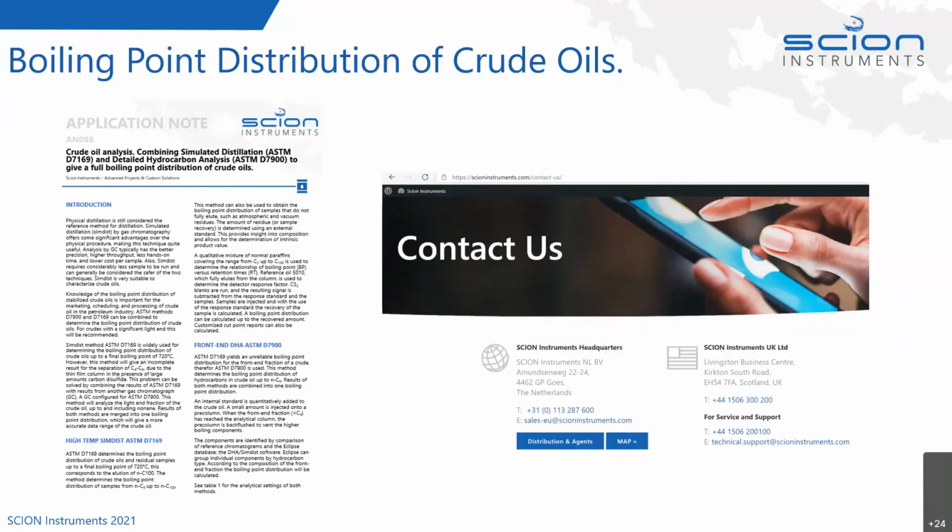So I hope you've enjoyed this hour looking at the boiling point distribution of crude oils. It's giving you a little bit of information between the hardware and the software that we can use, gas chromatography, to help with the assay of crude oils.